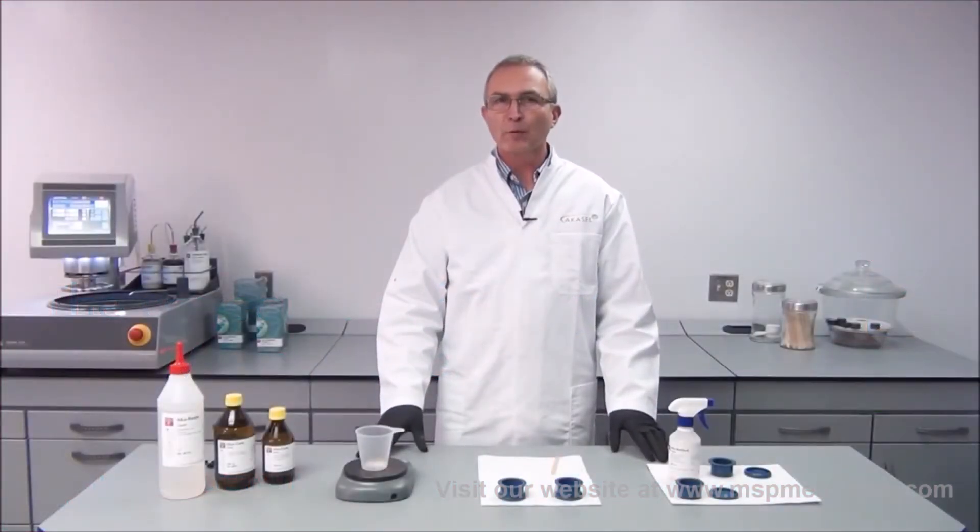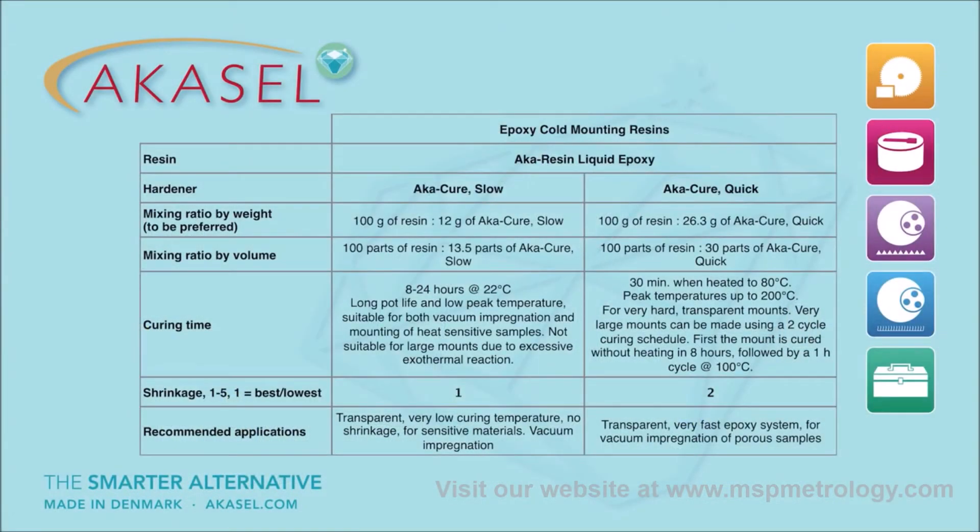My name is Michael Rueckert from AkaCell and I'm going to show you how to use cold mounting epoxy resins. We have our resin and two different hardeners: the AkaCure Quick, which is a quick-hardening epoxy resin when subjected to temperature, and the AkaCure Slow, which takes between 8 to 24 hours to cure at room temperature.